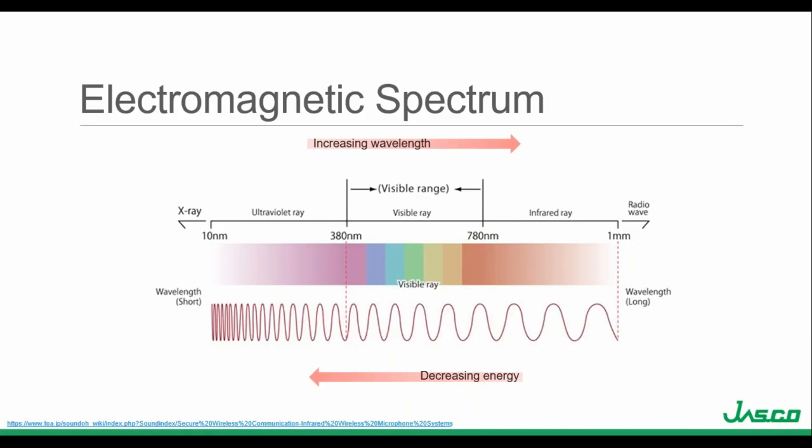The ultraviolet region is typically measured from 180 to 400 nanometers, the visible is 400 to 800 nanometers, and the near-infrared is 800 to 3200 nanometers. The larger the wavelength, the less energy involved, so chromophores that absorb in the UV region of the spectrum require more energy than chromophores that absorb at, say, 700 nanometers.